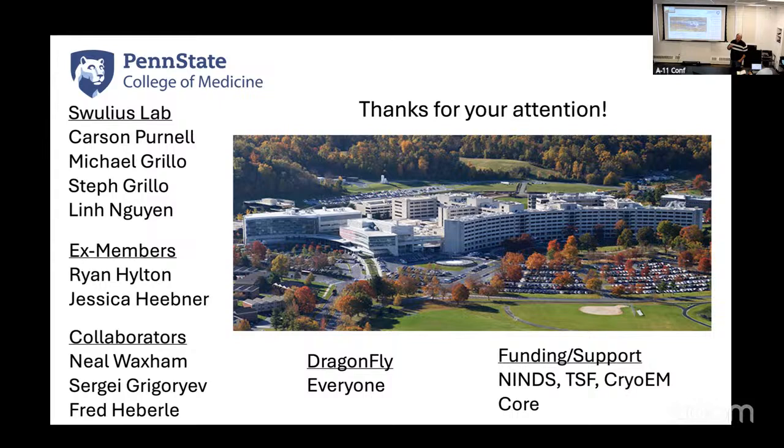Would you be able to manually set the noise model for making your synthetic tomograms? I don't know if I'm smart enough to do that, but if you tell me how to do it, can you just put in a block of noise? When Matt was doing his work, we just gave him the extracted noise profile, and it was based on that. I see. Make that put back in. I don't see why we couldn't do that, but I don't understand the process.